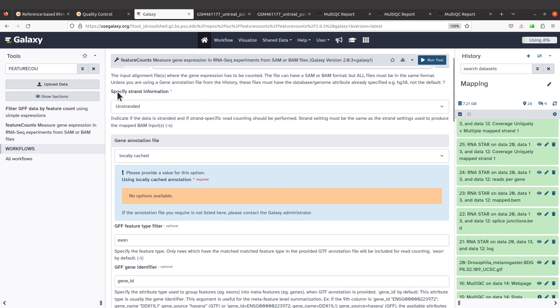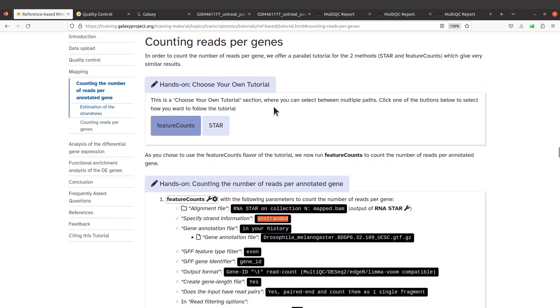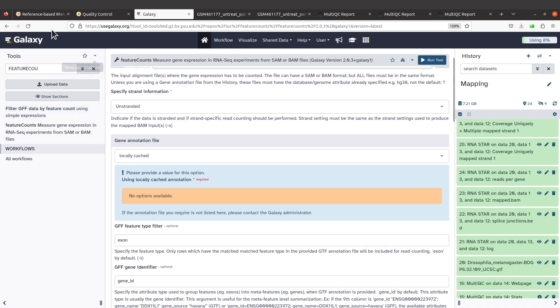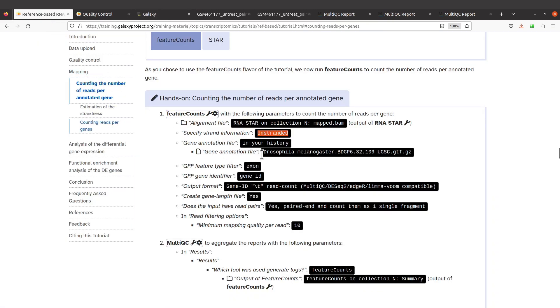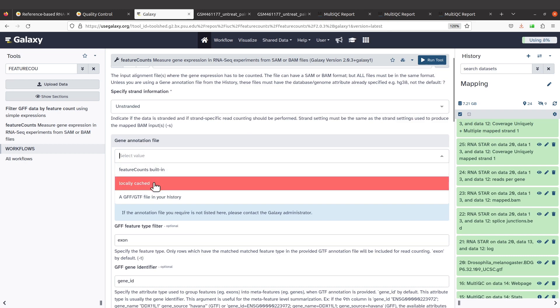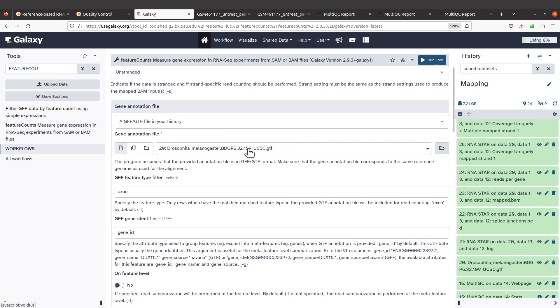For strandedness, we have specified strand information. We are using unstranded because that has already been determined. If you don't know the strandedness, just follow the instructions I showed above to estimate it. For the gene annotation file option, we are using the GTF file which I have already imported. I'll click and select the GFF/GTF file from my history. It has been selected for me, but if you don't see it, just click and select it.